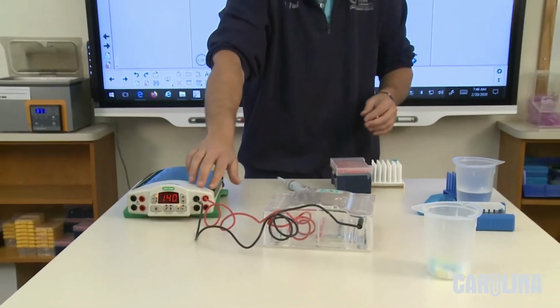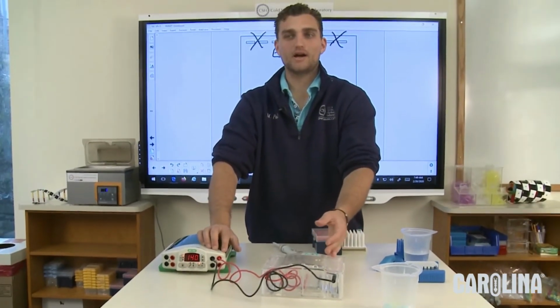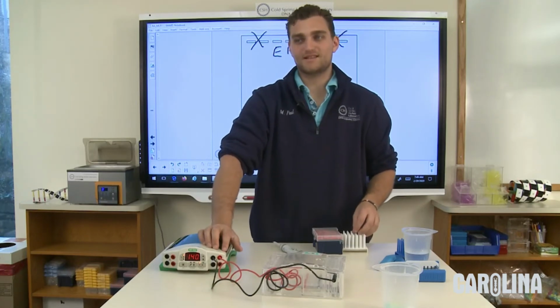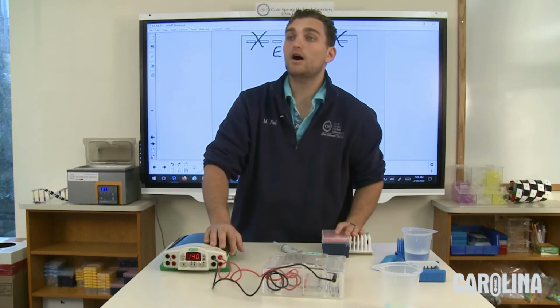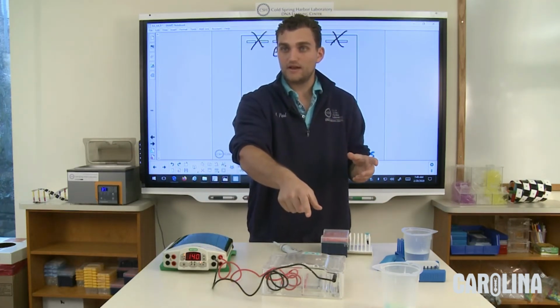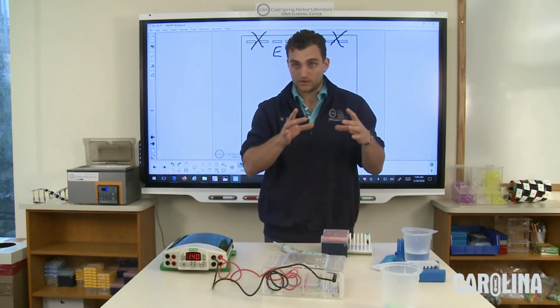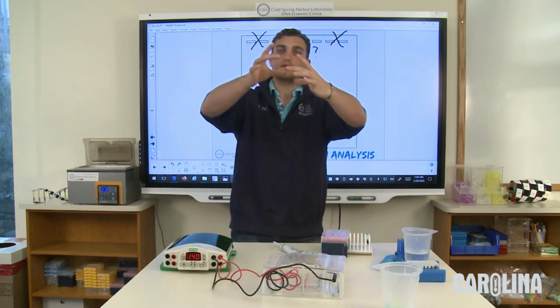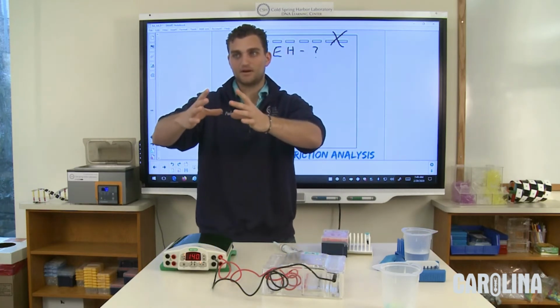If my DNA is closer to the black wire, which of those two is negatively charged? Yes, the black tube is negatively charged. Now, I actually just noticed a question asking if the DNA will mix when I inject it in there. The reason it won't is because the individual lanes will stay separate from each other.